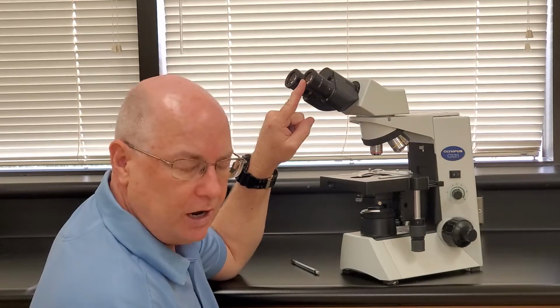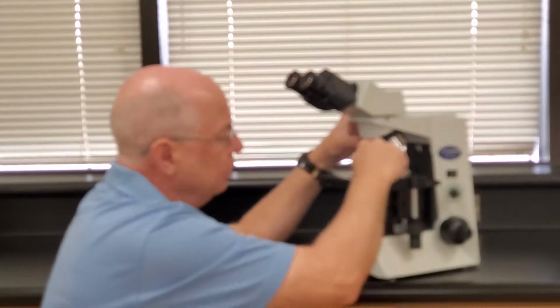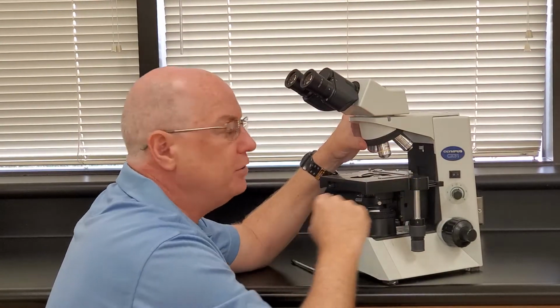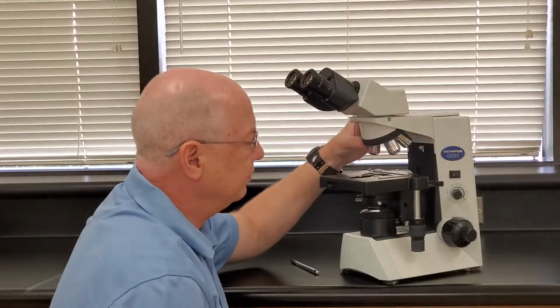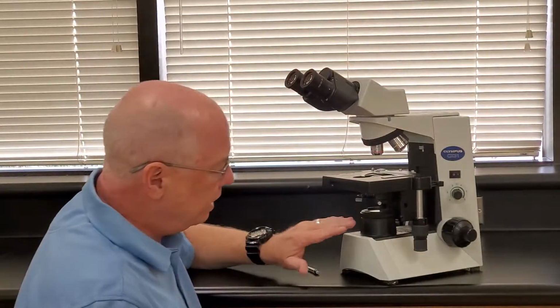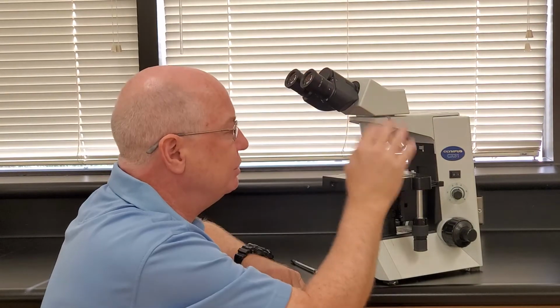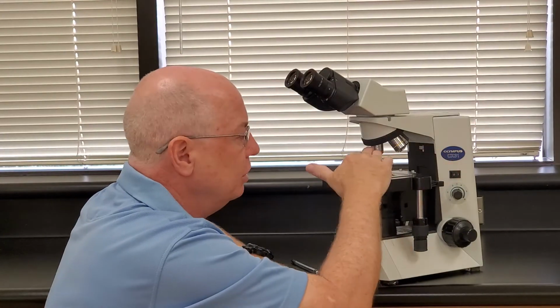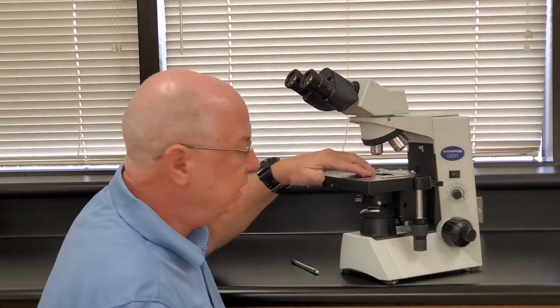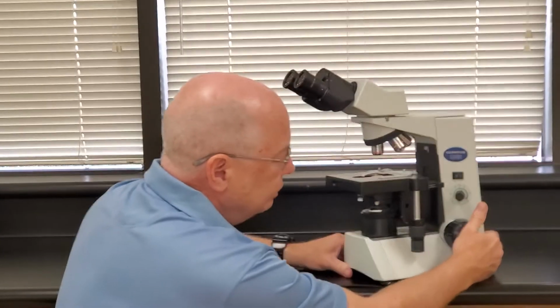These are oculars or eyepiece. Revolving nose piece, the black wheel. Objectives. Red is low magnification, yellow is middle magnification, blue is high magnification. The mechanical stage with the stage clip. We have the stage control knobs, we have the light source, and we have a condenser. Okay, you need to know those parts. Ocular or eyepiece, revolving nose piece, objectives, low, middle, high, mechanical stage, the stage clip, the condenser, the light source, and the stage control knobs.